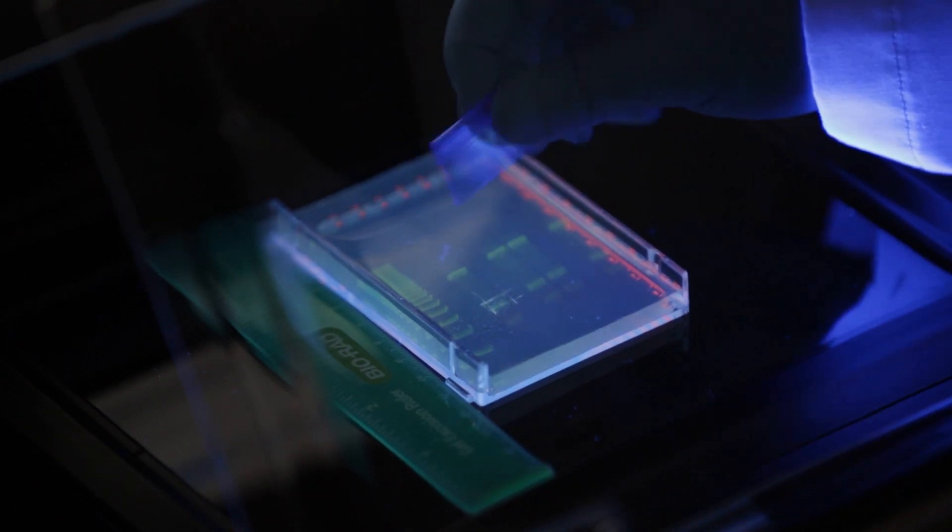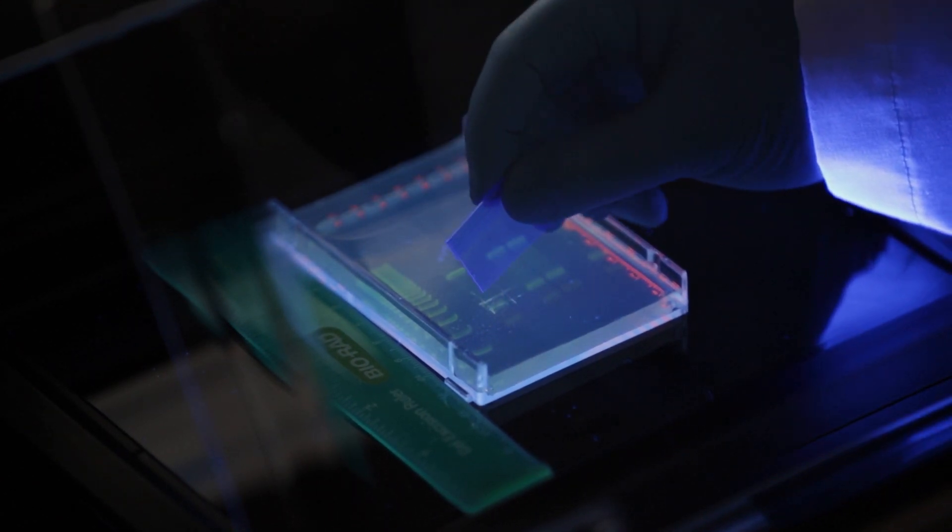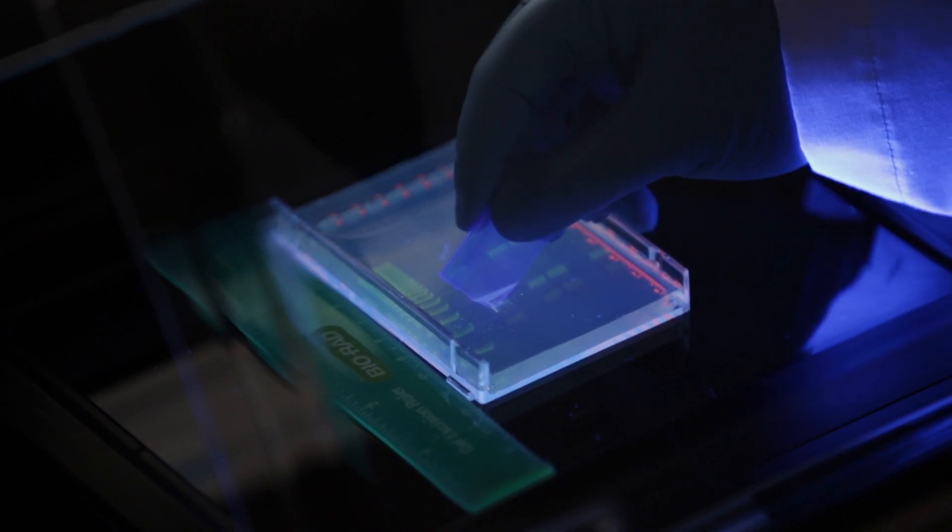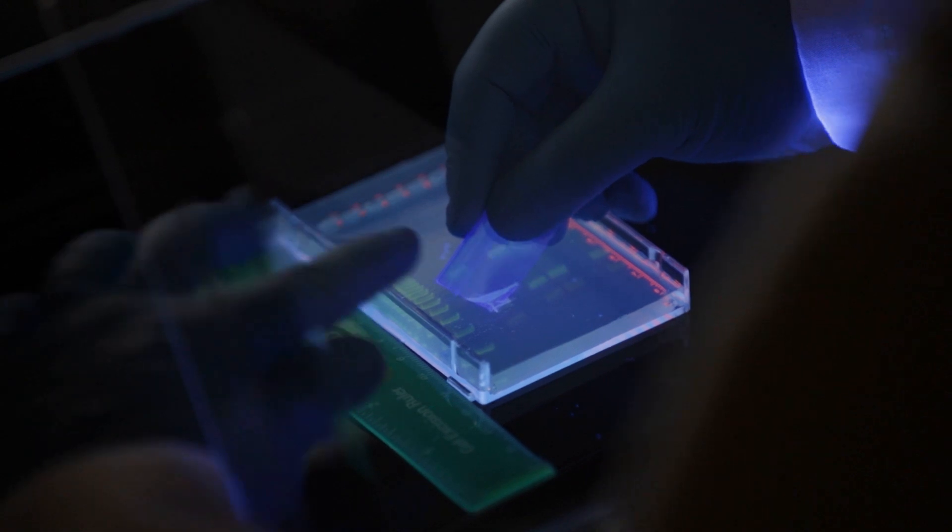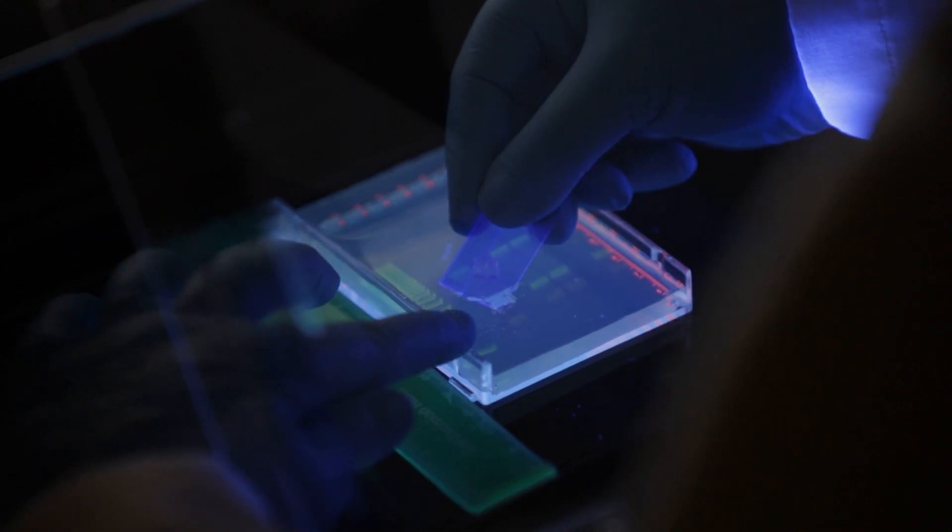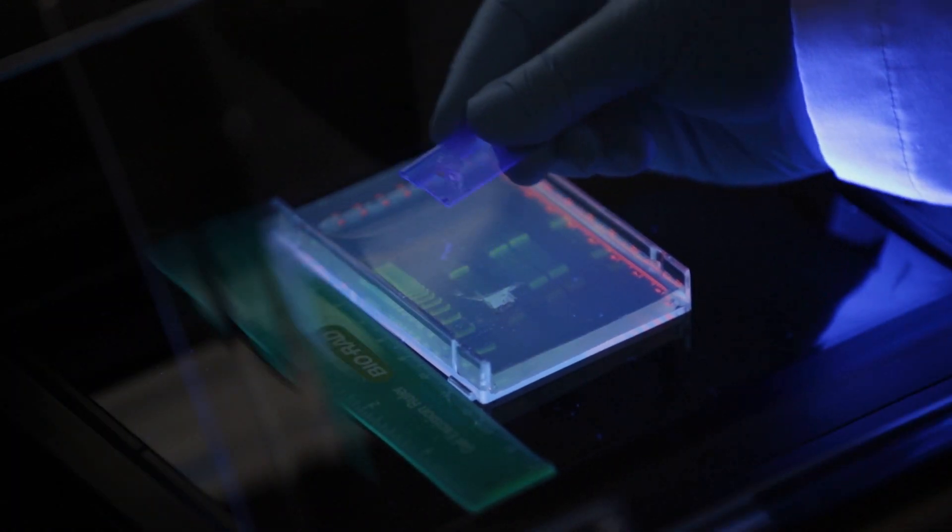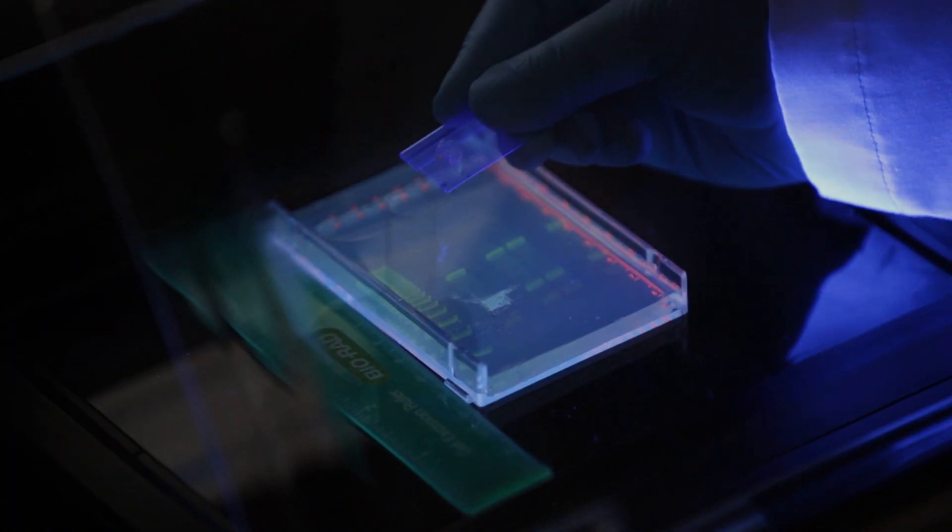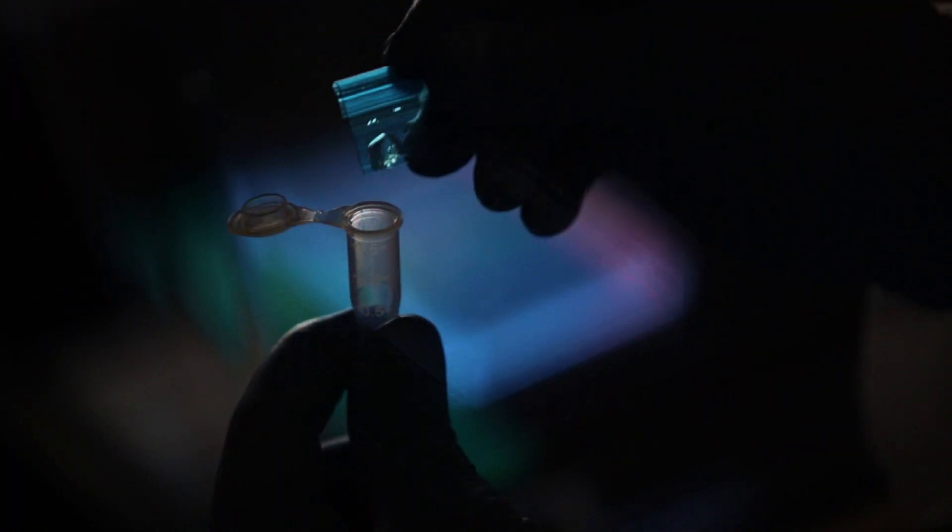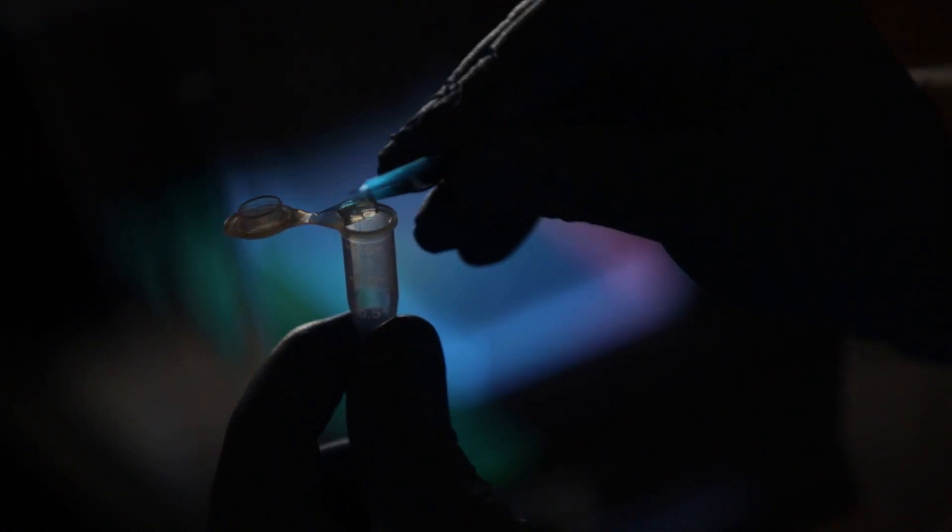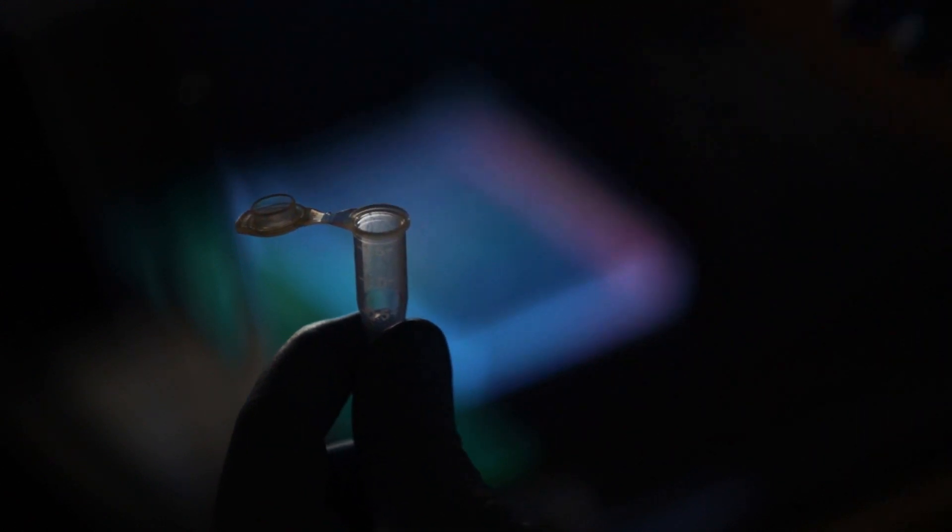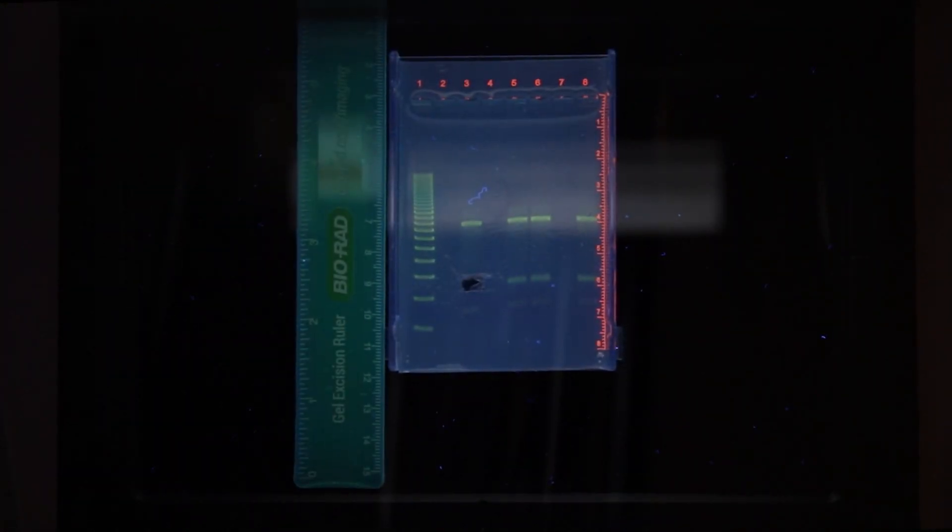The Gel.Go UV shield allows safe band excision directly on the instrument under UV light. Continue excising the remaining bands of interest. Make sure to use a new cutter each time.